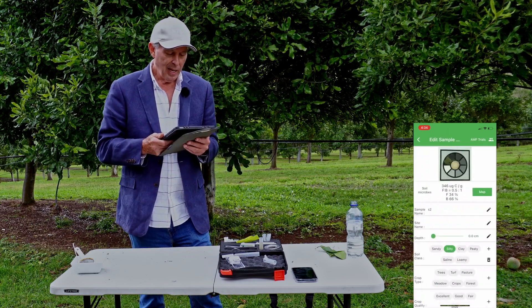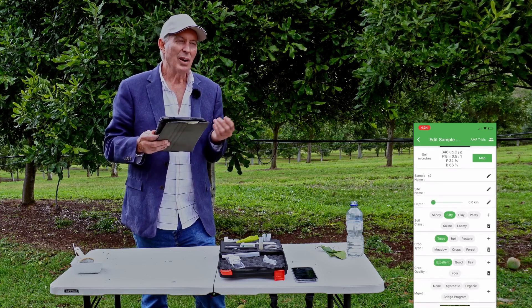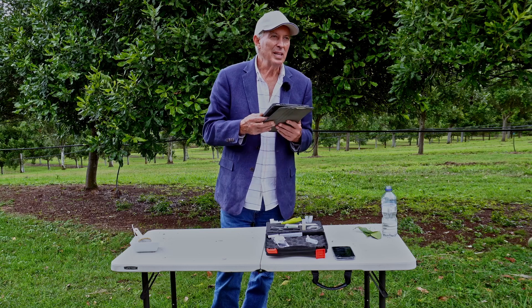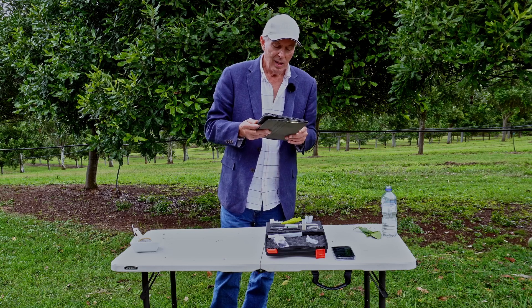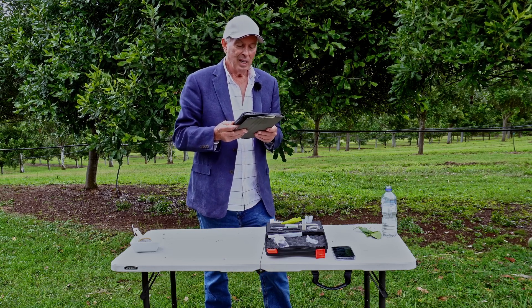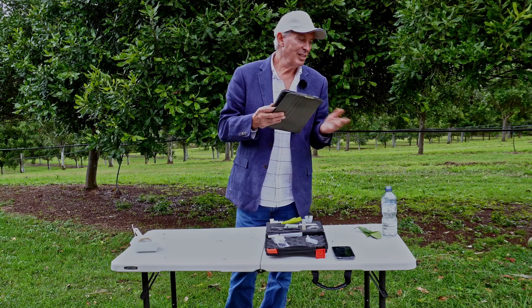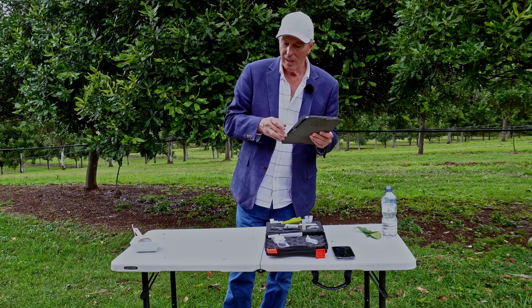We've got a reading: 40% fungi, 6% bacteria — we were taking it from a legume, which usually gives a bit more fungal content — and a microbial biomass reading of 600 micrograms, which is a really nice reading. You need to be around 400 to 600 for that beautiful soil to be working well. But it's looking like the fungal component needs a little boost — a little humic acid or similar in that scenario. And that's how we use the microbiometer.